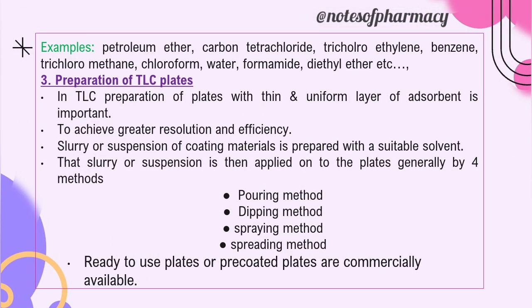Examples of solvent selection: petroleum ether, carbon tetrachloride, trichloroethylene, benzene, dichloromethane, chloroform, diethyl ether, diethyl formamide, ethyl acetate, pyridine, acetone, and propanol, ethanol, methanol, formamide, water, glycol, and glycerine.